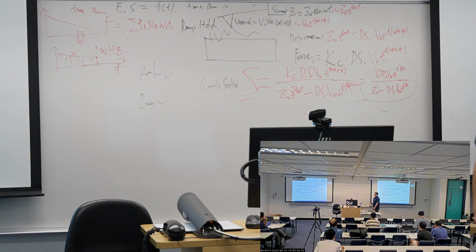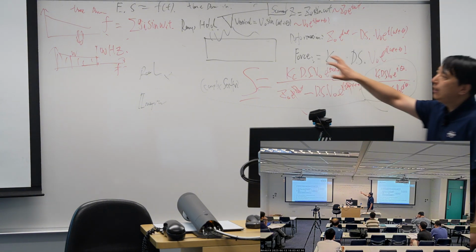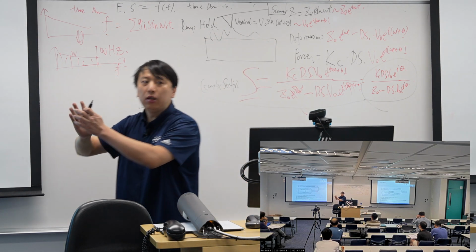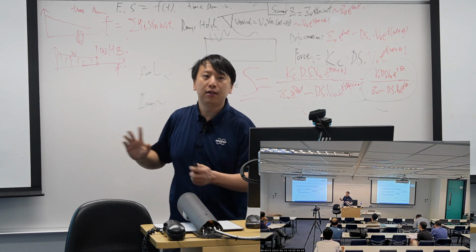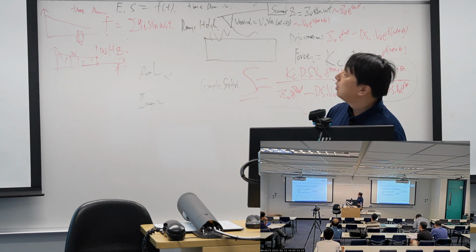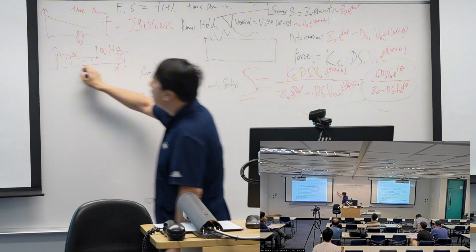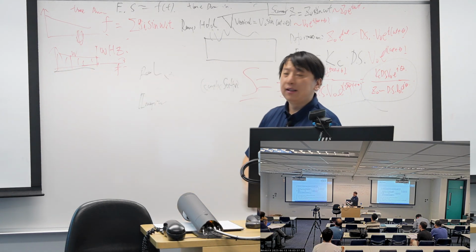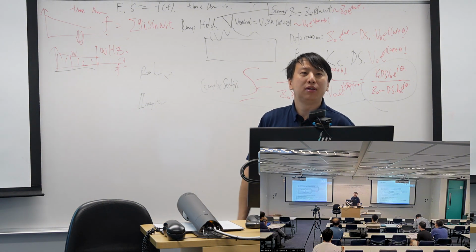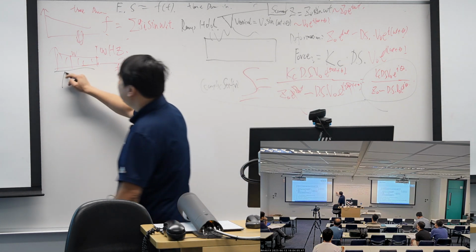So it's based on ramp and hold. But usually, when people do DMA, they will do a series of frequencies. So this one, they will also play the same games. They will measure a series of frequencies, and as such, we need to make a script of which frequencies we want. So it's ramp scripting.